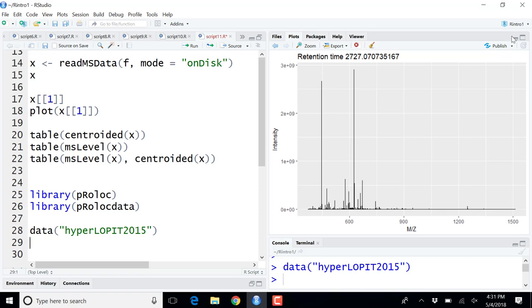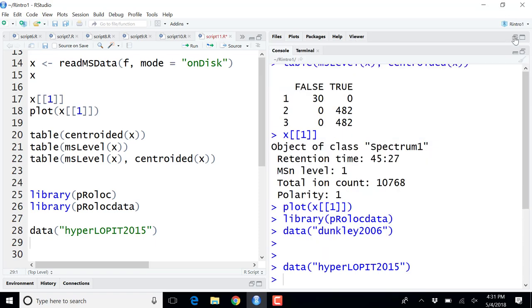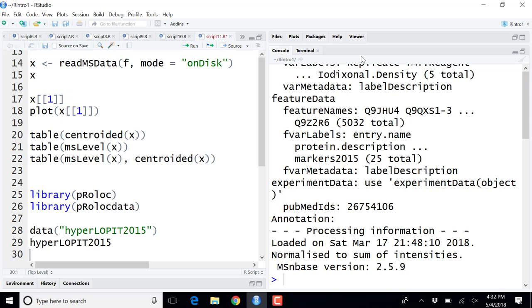So I'm going to skip how to load these spreadsheets in with readMSnSet2. If you type readMSnSet2, you essentially pass it the CSV and tell it which columns are your quantitative data. But I wanted to show you what these quantitative data sets look like.